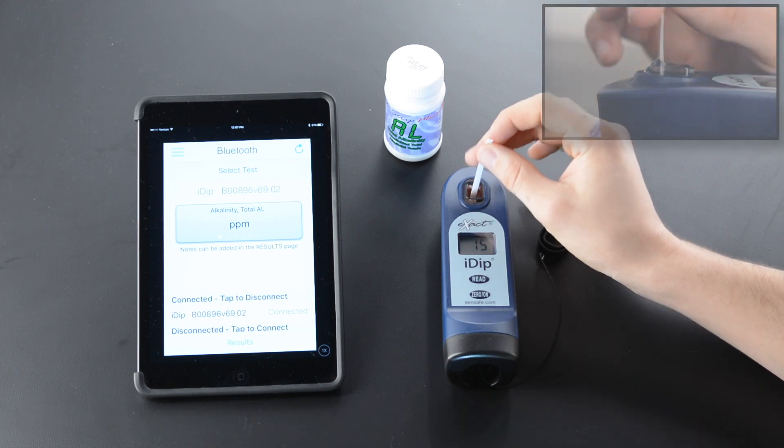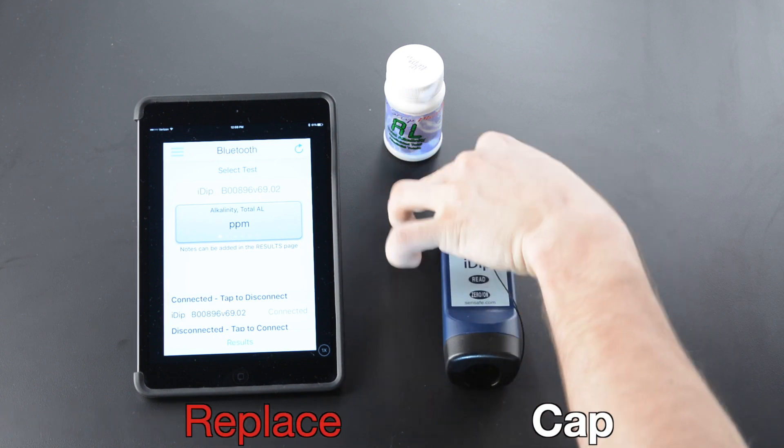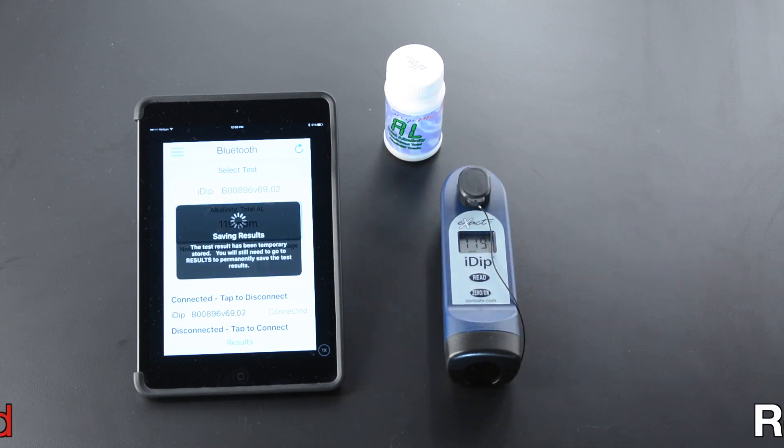Two strokes per second. Remove strip at one second. Replace cap. Read result.